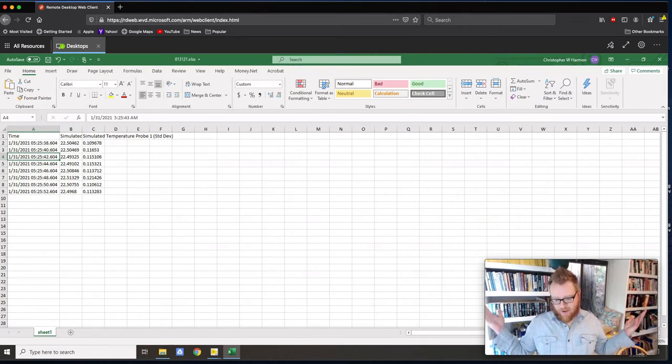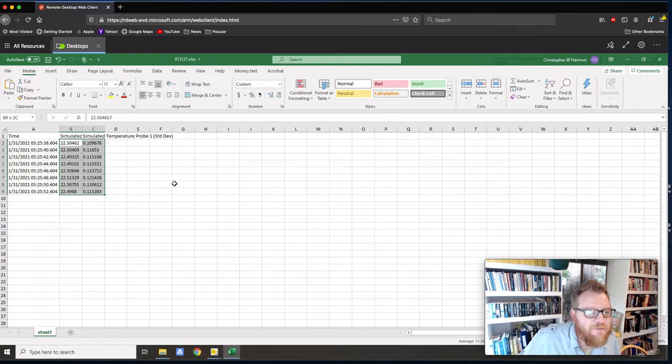But whatever. I'm fine with getting a data point every 2 seconds because what's important now is, if I had a hard time trying to estimate by my eyeballs what that temperature actually was, I now have some really high precision on what that data was.